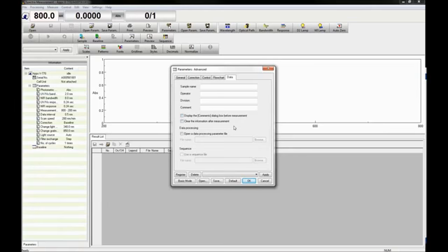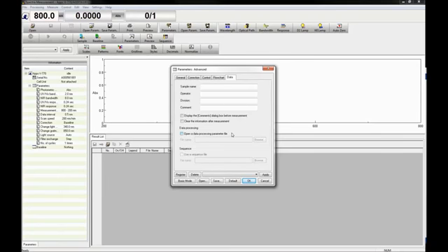You can also perform data processing on the obtained measurement using a previously created processing file, or if the flowchart has not been selected, you can open a sequence file to perform sequential measurements.